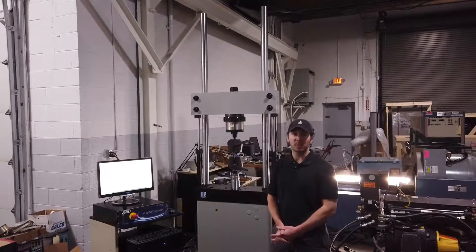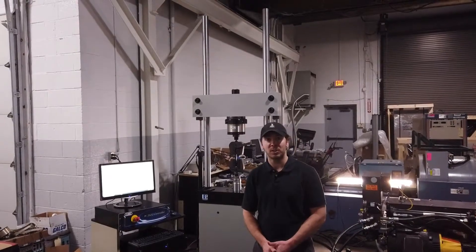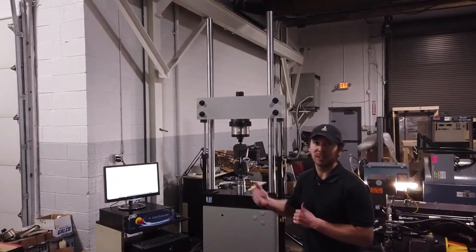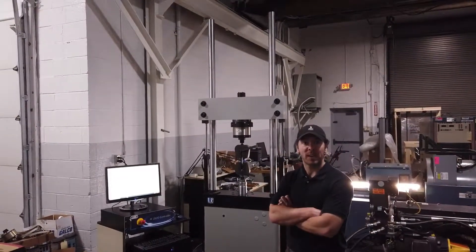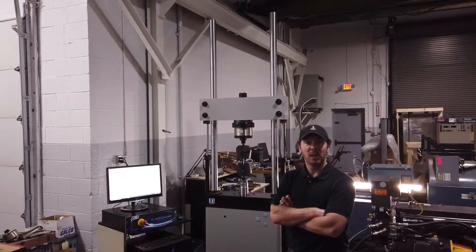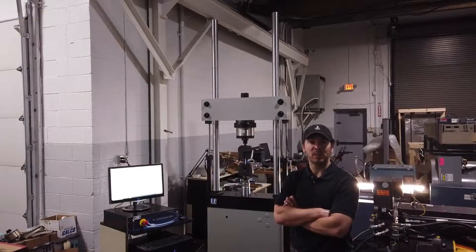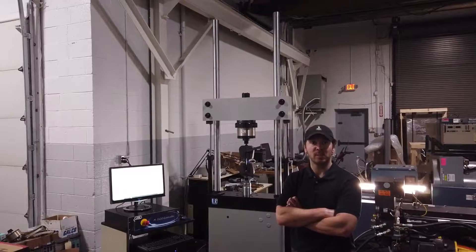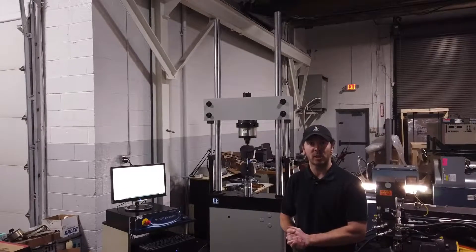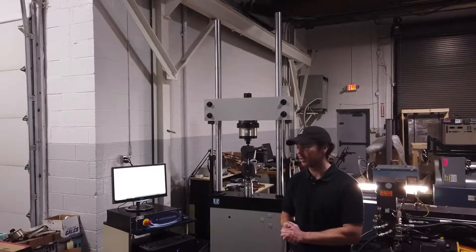Hi, I'm John Stetzel with Crank Baker Machinery. I'm going to go over this Instron 8502 Dynamic Fatigue Testing System we're just finishing up here for one of our customers.